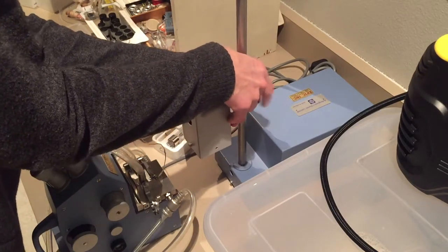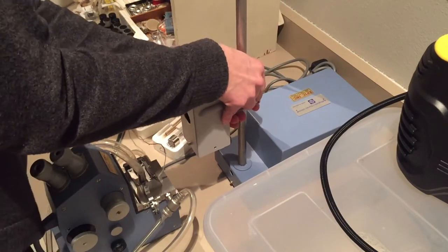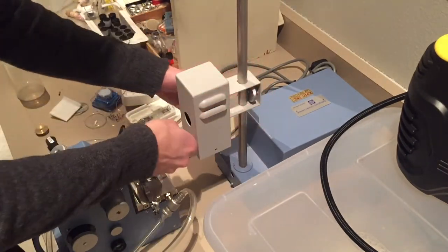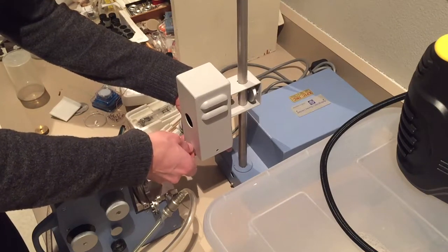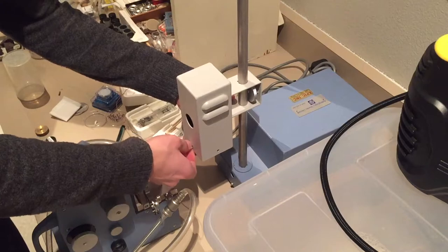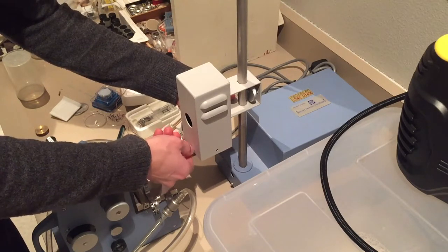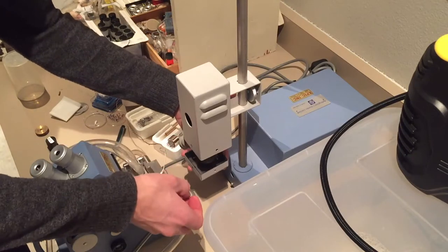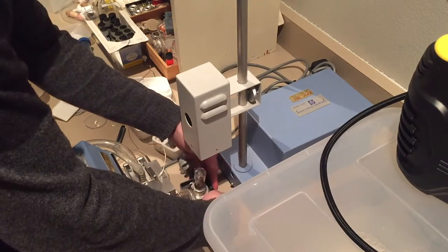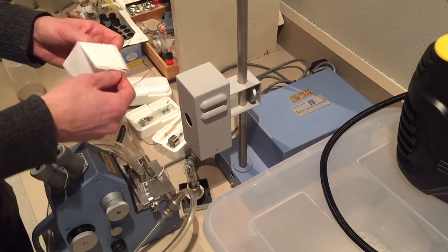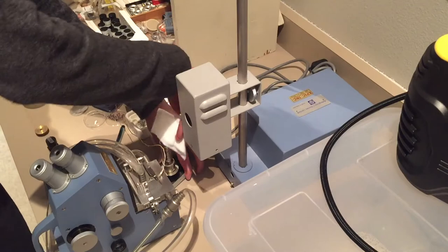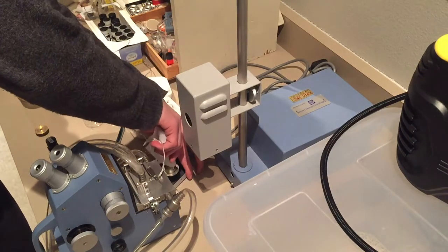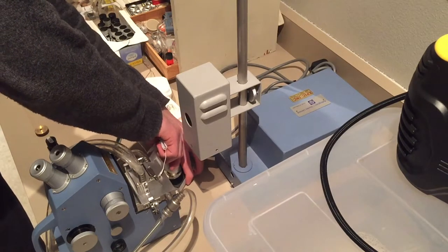I have a set of refractive index liquids. They're a little bit older but they're well taken care of. The first thing you want to do if you're trying to be precise and accurate is check what their actual refractive index is. Even though the label says something, over time they may degrade due to vapor pressure or what have you.